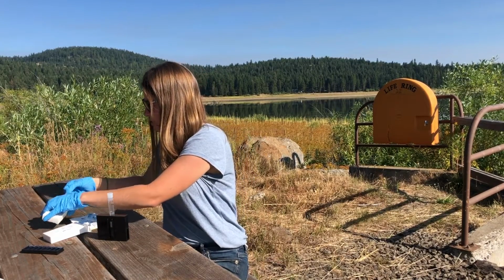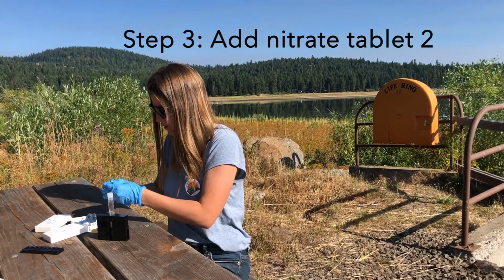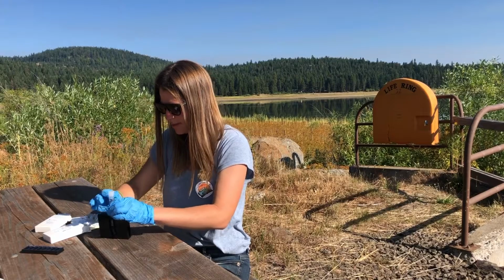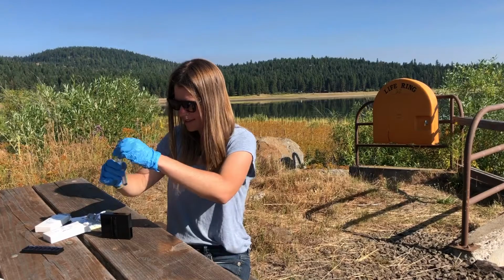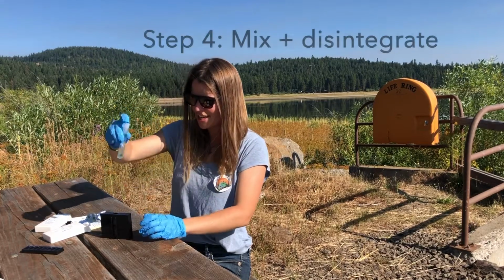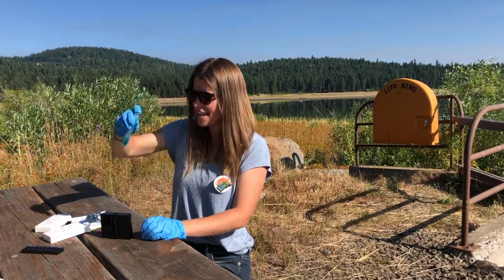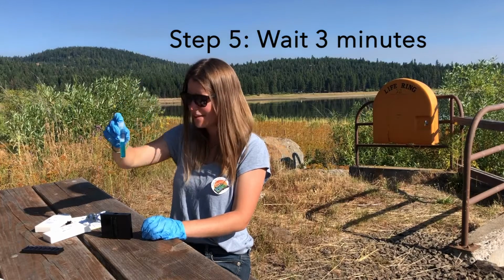nitrate tablet number 2. Should have opened it first. Okay, and put the top on. Shake, shake, shake. Ooh, this one's blue. Okay, it's disintegrated. Now we have to wait 3 minutes. Start your timer.